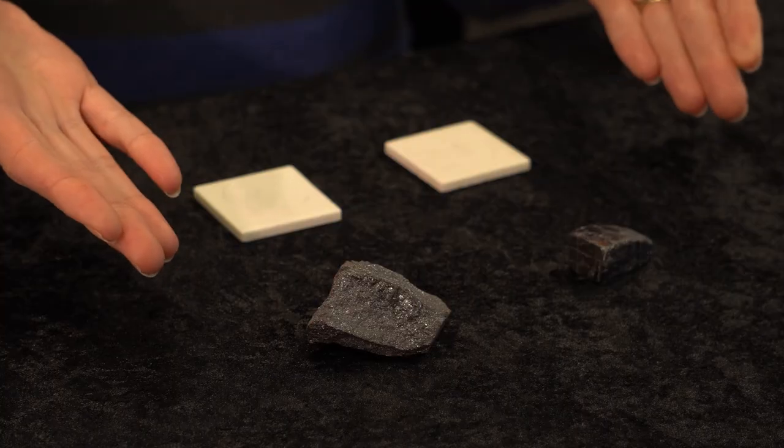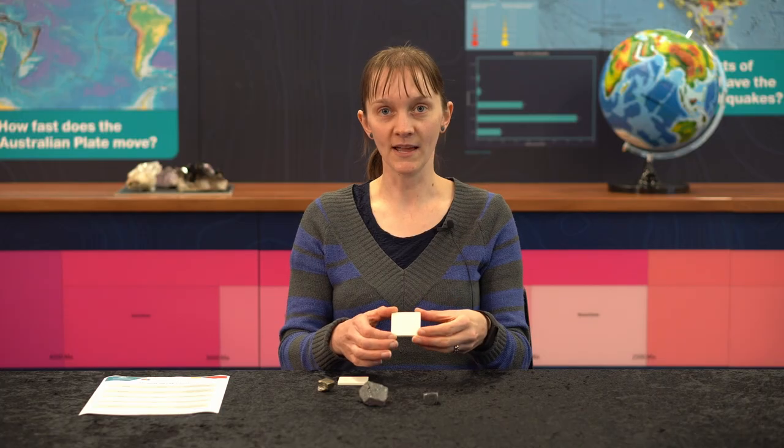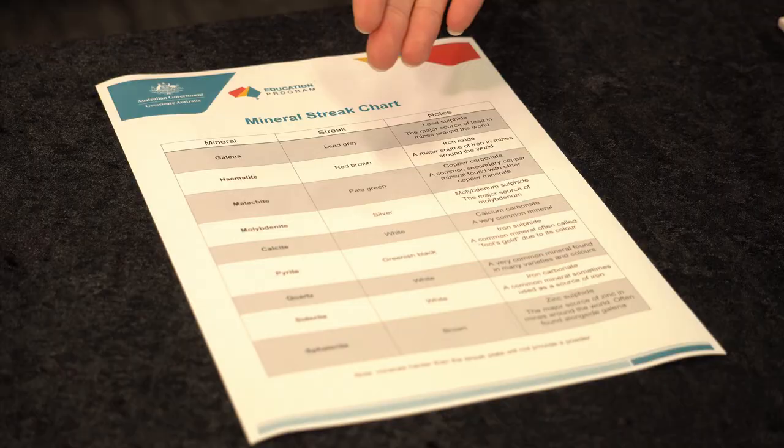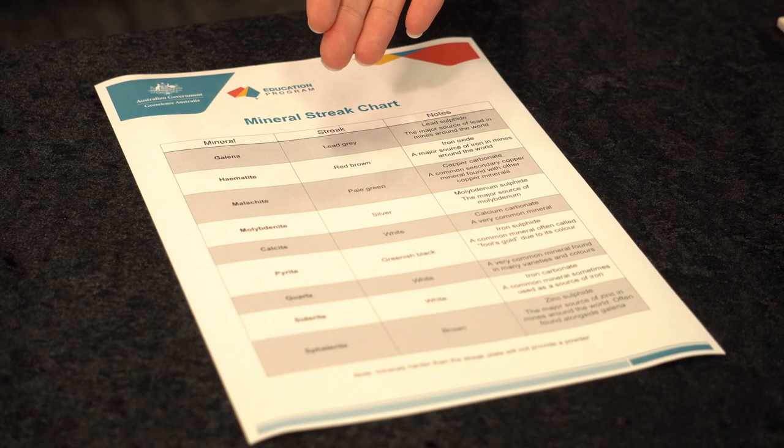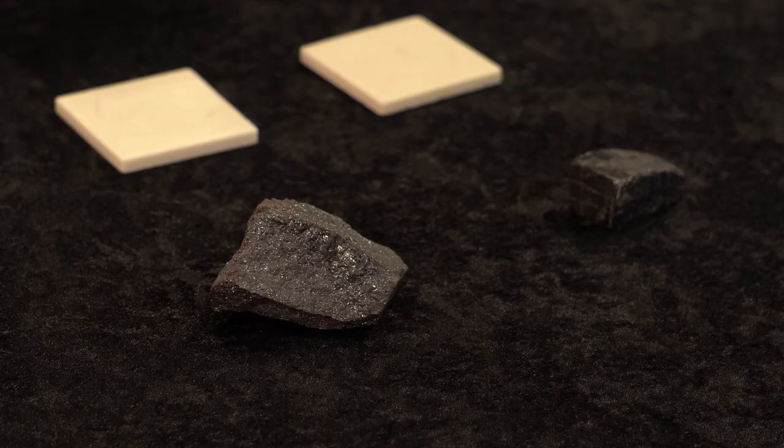Some specimens of the same mineral can be different colours, but if you do the streak test on them they will always have the same powdered colour or the same streak. For this activity you will need various unknown specimens, streak plates, and a mineral streak identification chart. Today I'm going to use the streak test to try and identify these two unknown minerals which look quite similar.